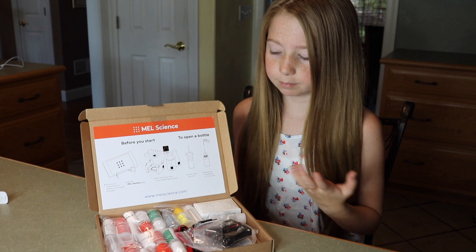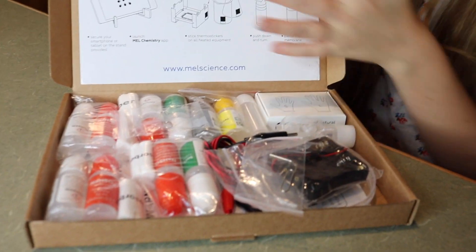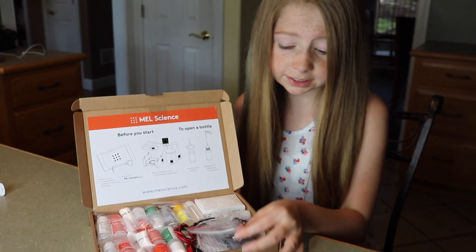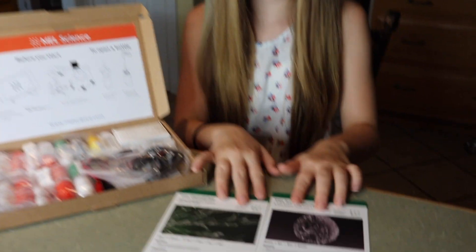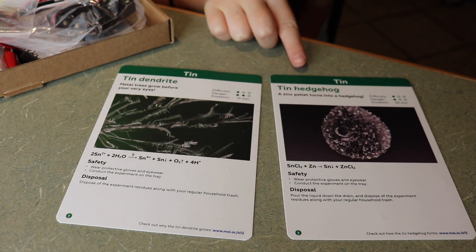So I think we're going to try the tin one first. Here's what the tin kit comes with — you get all your chemicals, a paper clip, some gloves. It tells you what to do, some wires, and a little plate. It also comes with these two cards that you can use, showing what you can do with this kit.